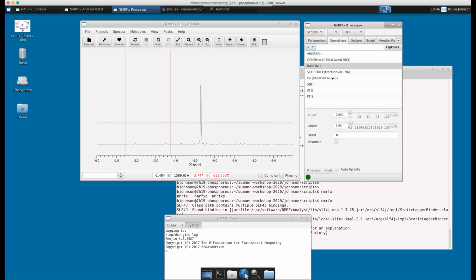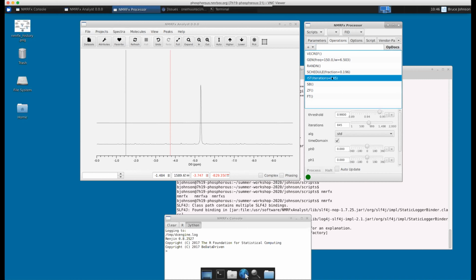These algorithms, whose fixed point corresponds to minimum L1 norm, end up introducing non-random baseline artifacts. I think I've published on that, but I'll dig it out and post some references. That'd be cool.